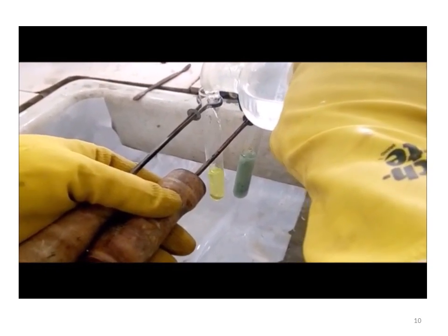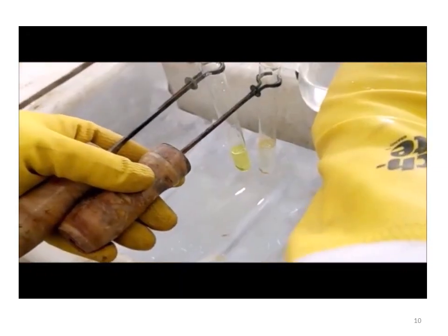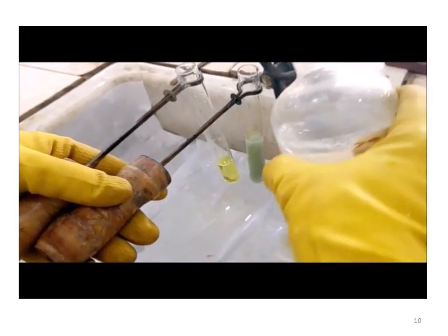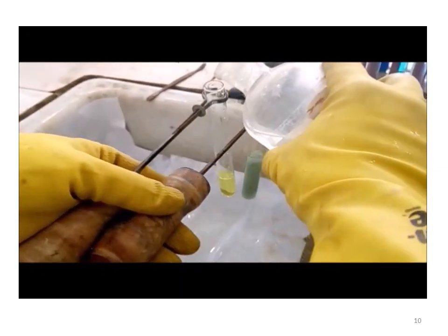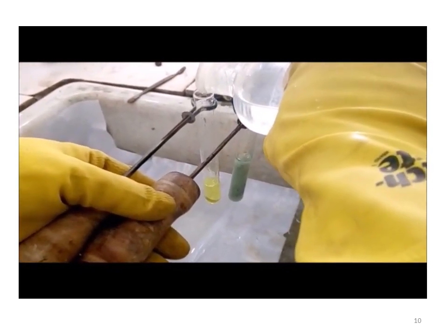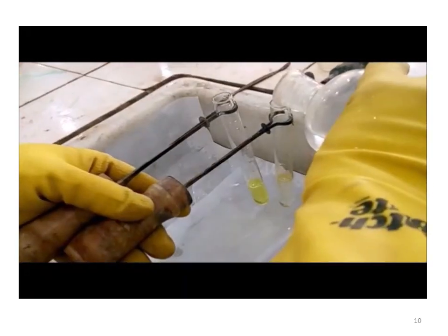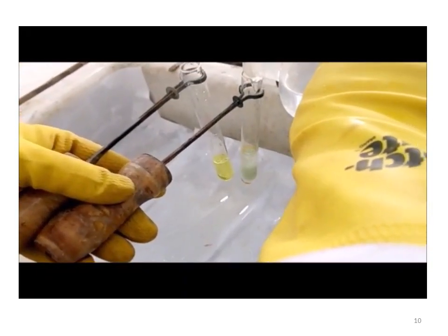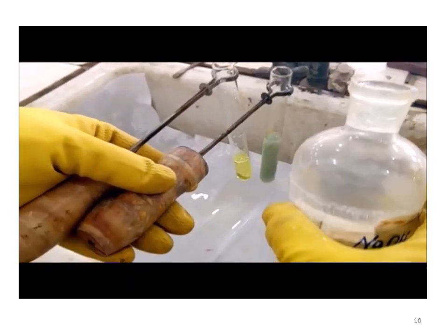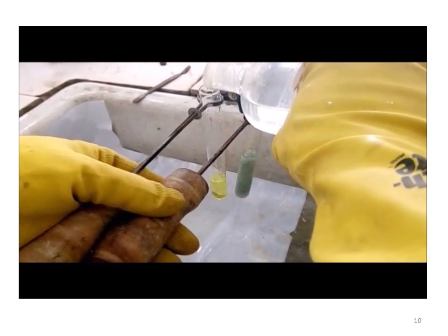After the addition of sodium hydroxide in the first test tube, olive green or dirty green precipitate appeared, while in the second test tube where potassium ferrocyanide is present, when sodium hydroxide was added, no dirty green precipitate appeared, but the yellow color of potassium ferrocyanide remained unchanged.